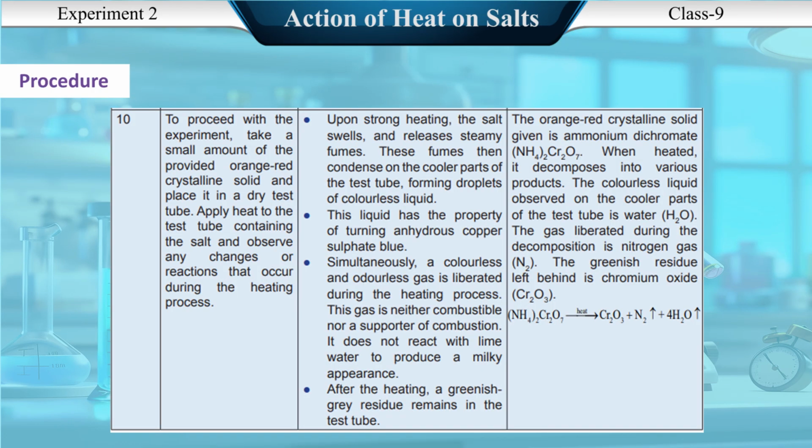Simultaneously, a colorless and odorless gas is liberated during the heating process. This gas is neither combustible nor a supporter of combustion. It does not react with lime water to produce a milky appearance. After the heating, a greenish-gray residue remains in the test tube.